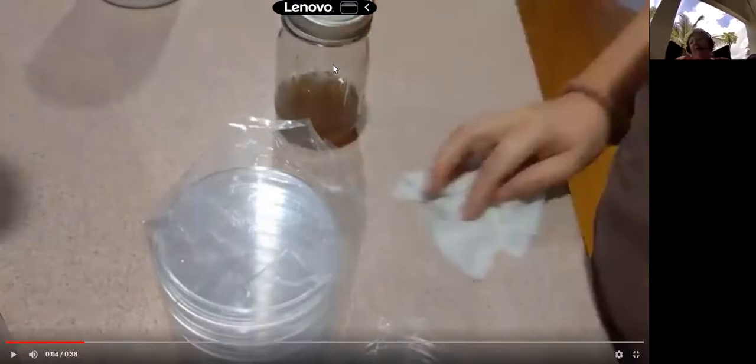The agar has now sterilized, it is dissolved, and it is cool enough that you can hold the jar. That's an important fact. You don't want it so hot that you're burning yourself while touching it. And you also want to make sure, because this is now sterile, we have no contaminating microorganisms in here. The plates that we're going to pour our agar in are also sterile.